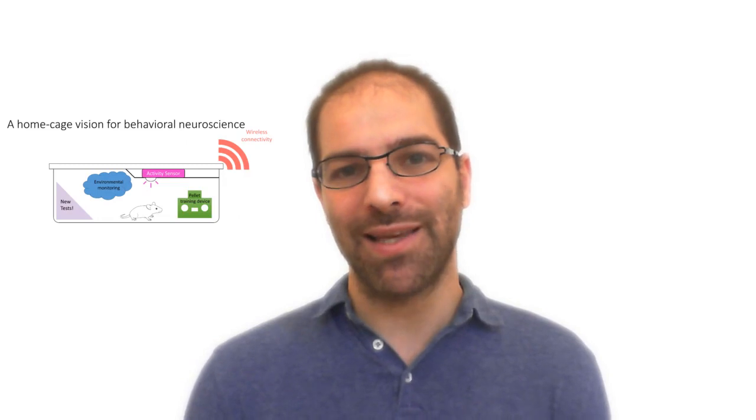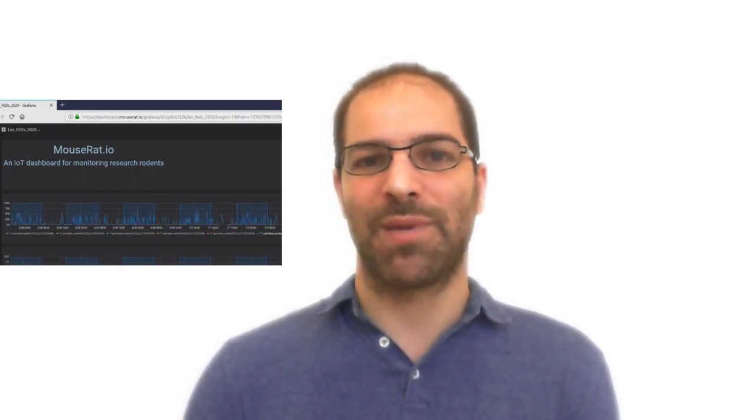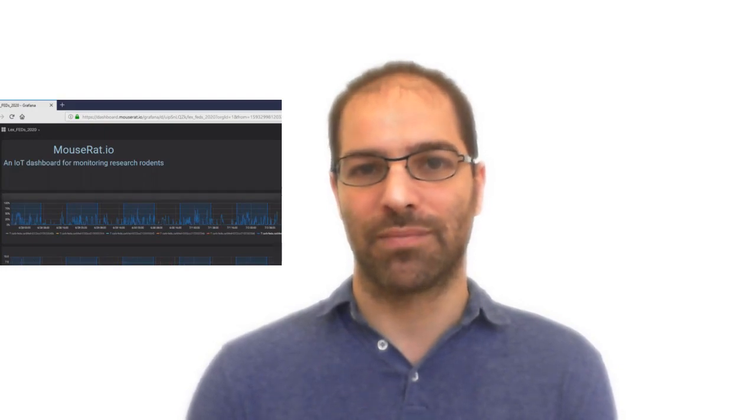What I want you to remember from this talk is this home cage vision for behavioral neuroscience, which I think is one solution for addressing the problems of throughput and reproducibility in neuroscience. In addition, this cloud-based vision opens up new opportunities for data sharing, for data transparency, for online analyses with real-time results, and I think these things are going to become more and more important in the future.